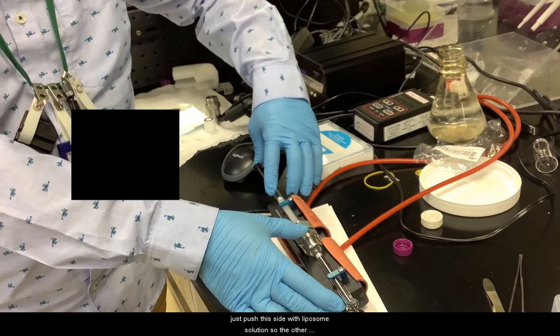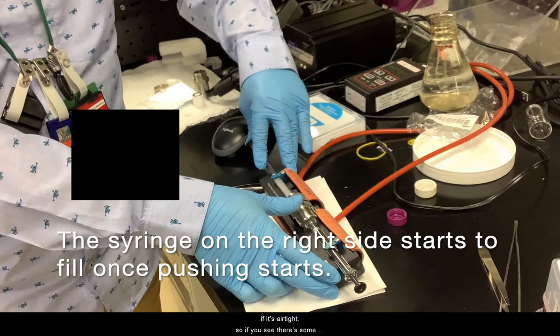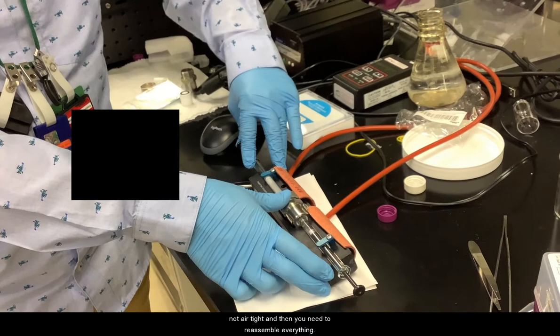The other side will come out automatically if it's air tight. If there's some leakage from those areas, that means it's not tight enough. It's not air tight. Then you need to reassemble everything.